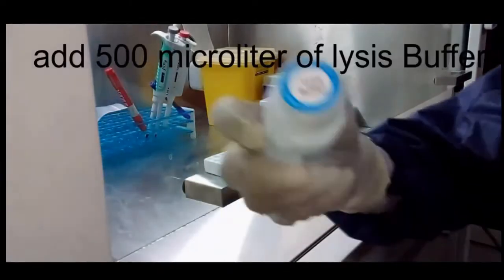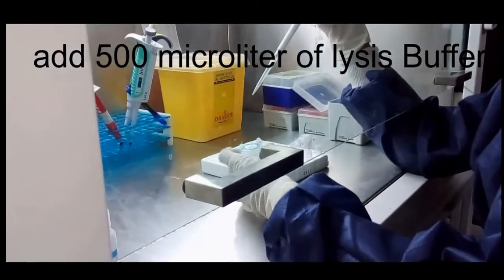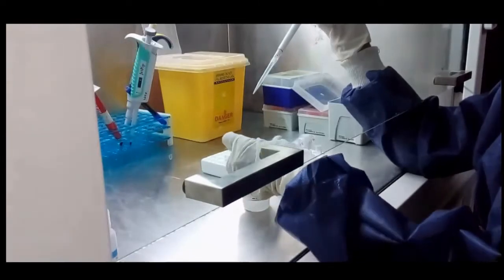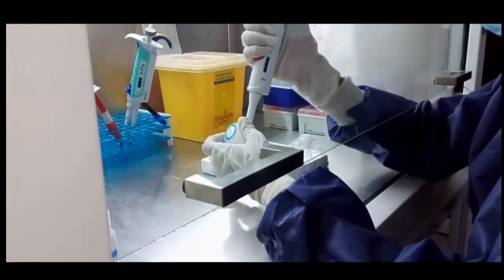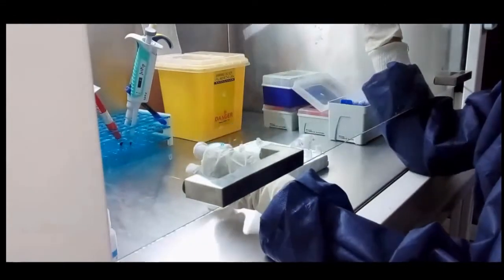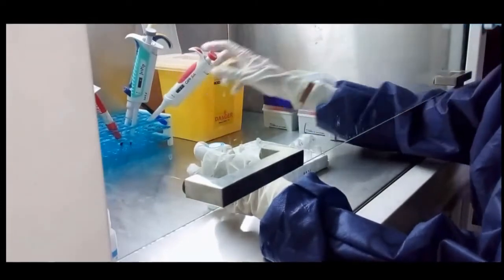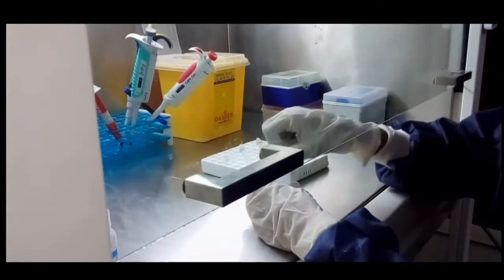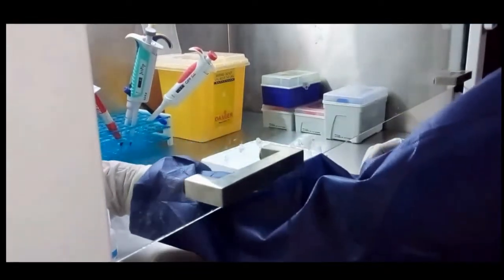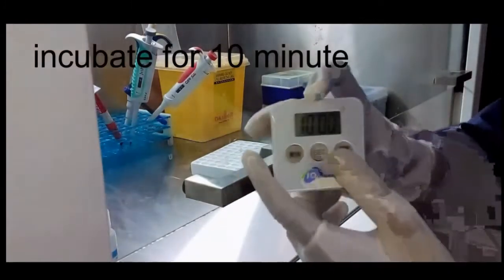Add 500 microliters of lysis buffer. Vortex and incubate for 10 minutes.